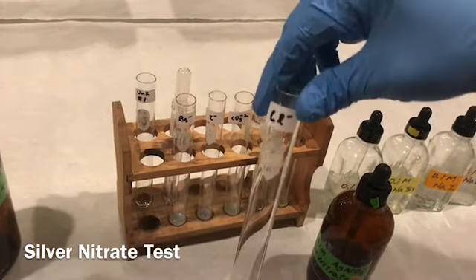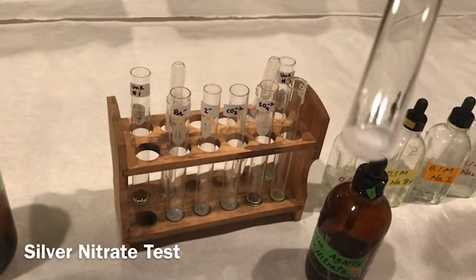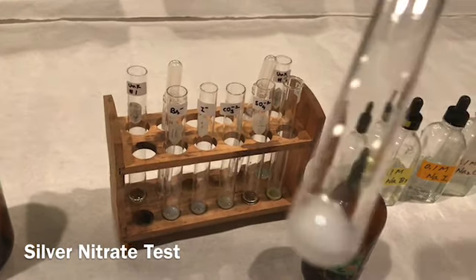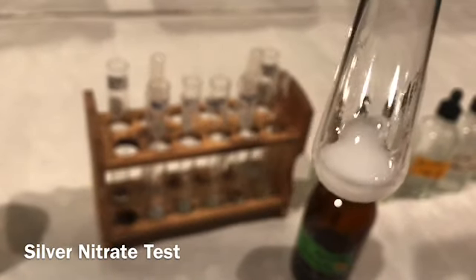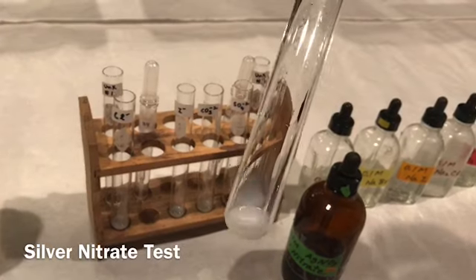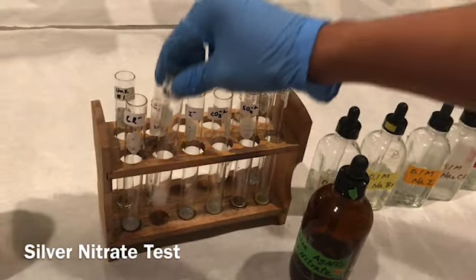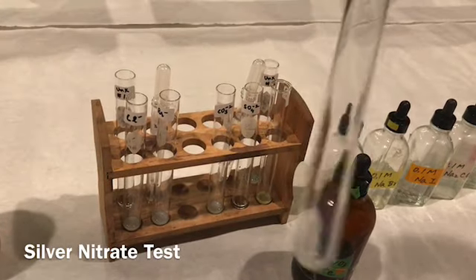So this is the chloride. See that, how does it look? Okay, this is the bromide. Iodide.